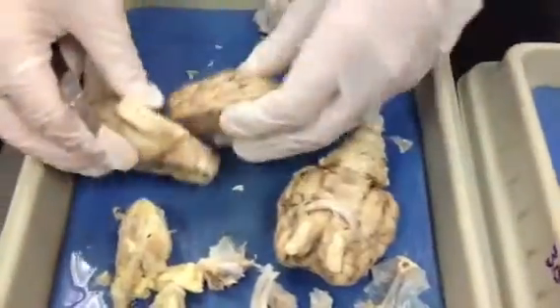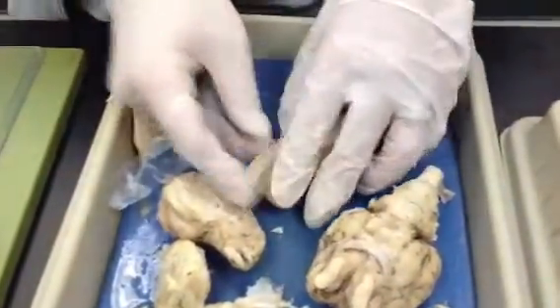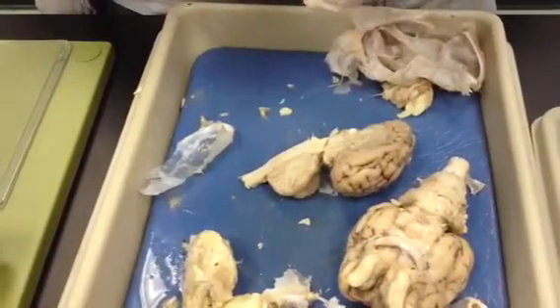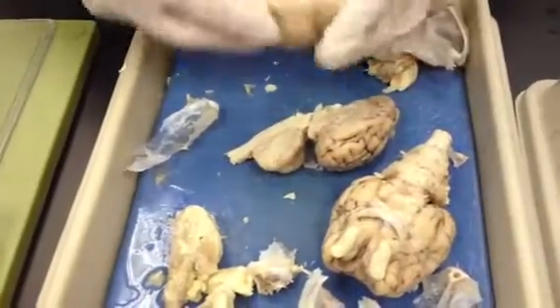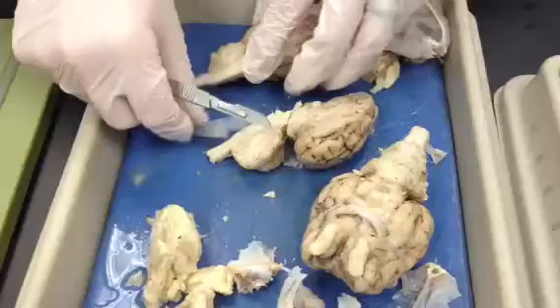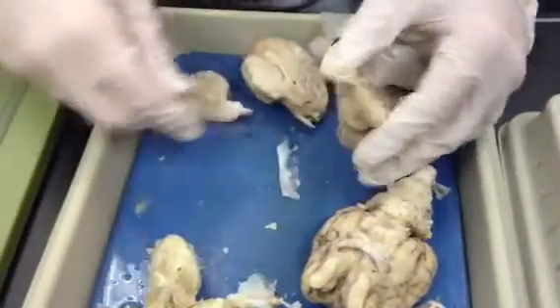And then here we have... How are they numbered? Is it by the ones that come first, like the sense that comes first? I know sense of smell comes first. Is that how they order it? No. Just kidding. No, that's how I remember it then. And you're one. Janelle, it's scary how much you know, seriously.